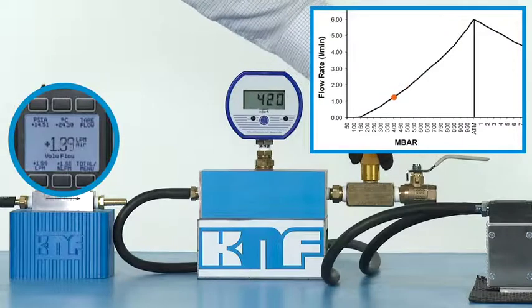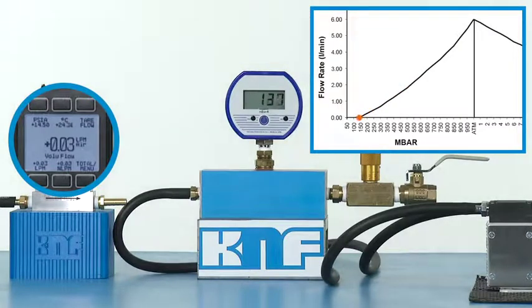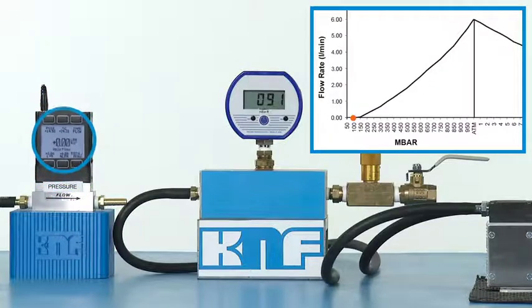Maximum vacuum capabilities of the pump are measured by completely closing the valve on the inlet side of the pump. When the flow meter displays a flow rate of 0 liters per minute, the vacuum gauge will display the maximum vacuum generating capability of this pump.